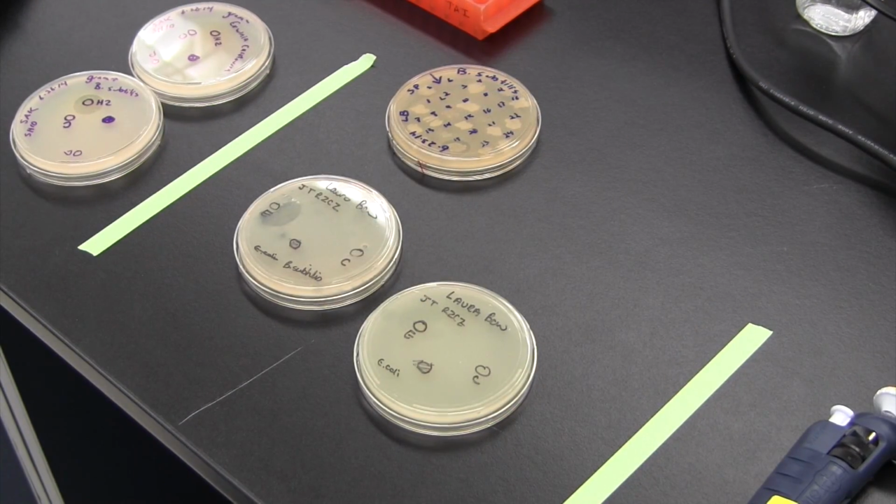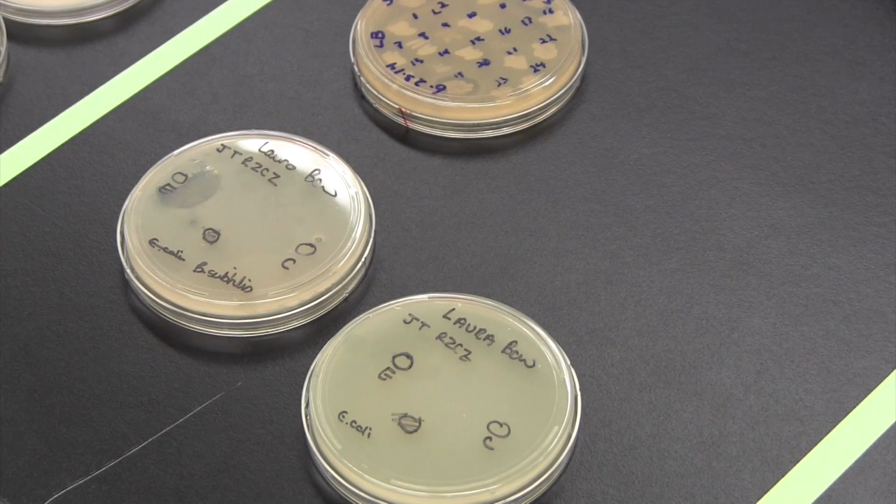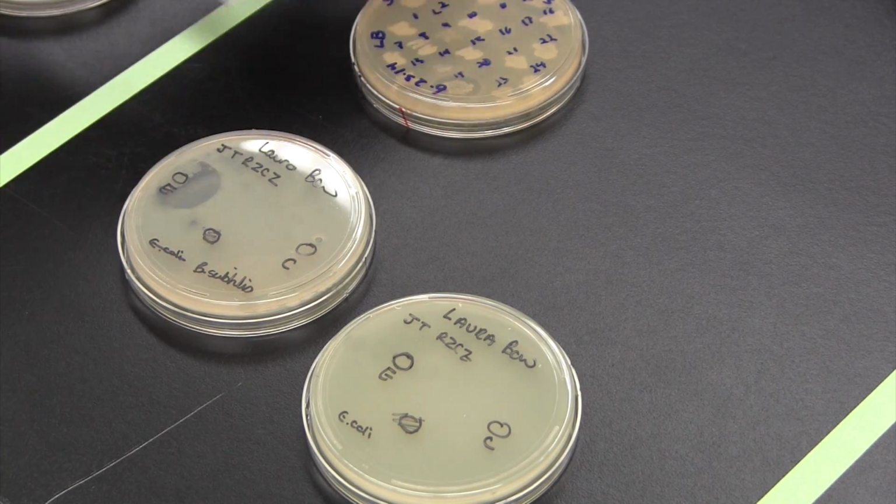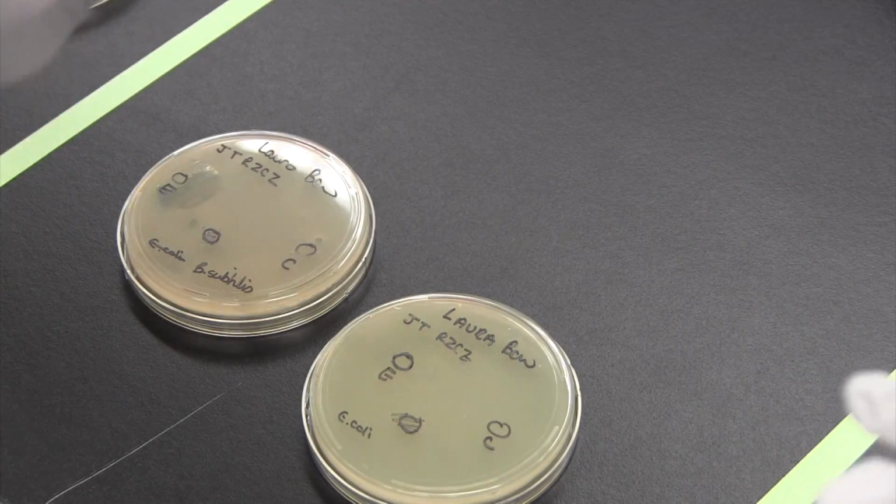Okay, so here we are. We're ready to look at our actual data, the actual results that came out of our chemical extraction that you have spent the last 4 sessions working through with your students in theory. And we have some really great examples of positives and also of some that didn't really work. And it's kind of interesting when you look at all the pieces together.